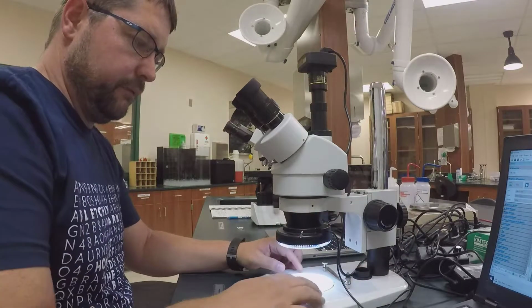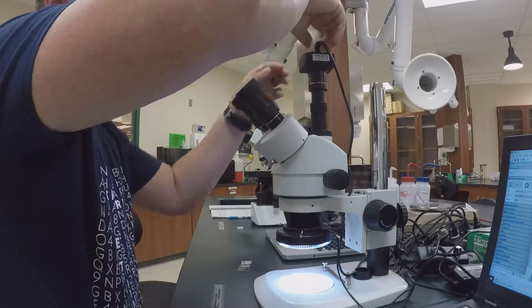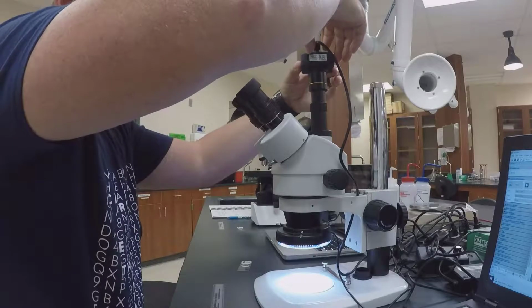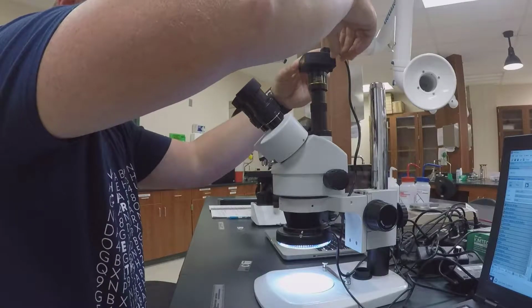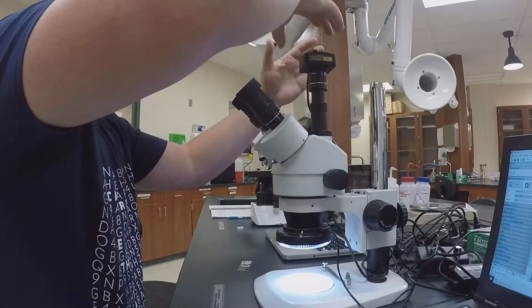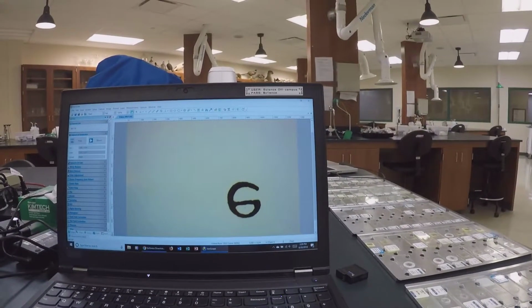Because my camera is kind of out of whack, sorry about that. The camera's not tight. As you can see here, there's the image.